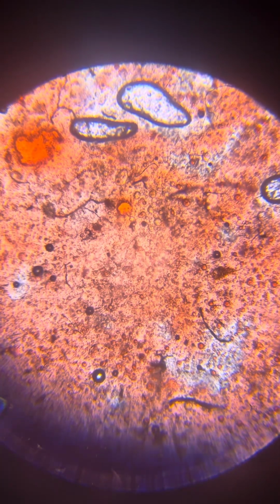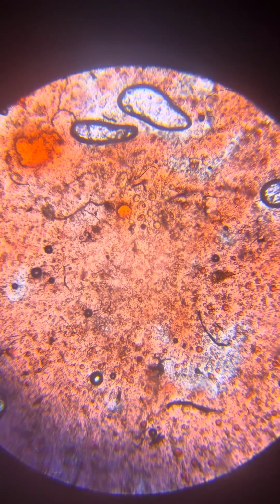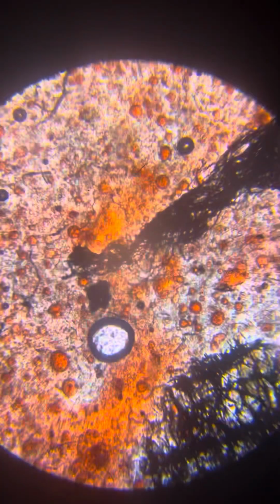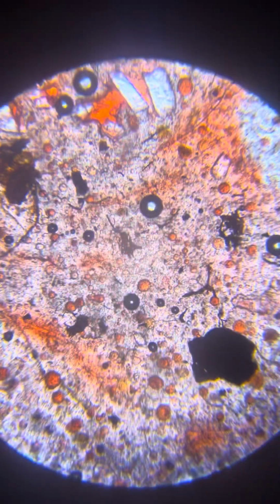Same mixture, but this time with the red color. We already see Neros of all sizes, all shapes. Very nice. It's about the same, which is great. Different shades because, of course, of the different stain. Wow, such a nice thing. Really, these two slides are amazing.